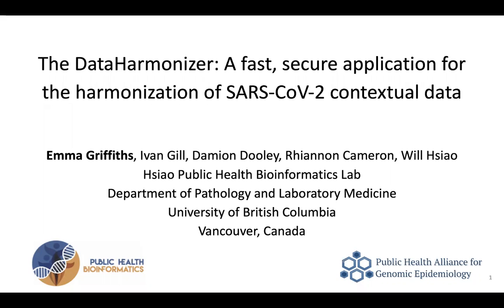And for enabling me to tell you a little bit about our work on developing a SARS-CoV-2 genomics metadata standard and a tool to enable public health labs and researchers to better harmonize and integrate information across data sets and databases as they continue working towards an increased understanding of SARS-CoV-2 epidemiology and biology.